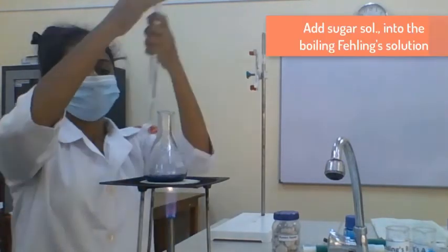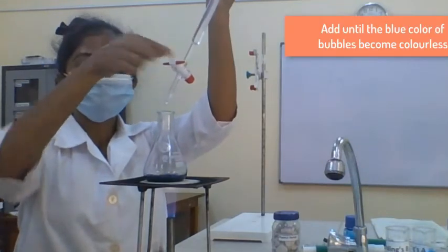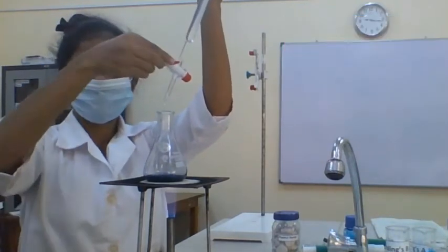Then add sugar solution into this solution until this solution becomes colorless.